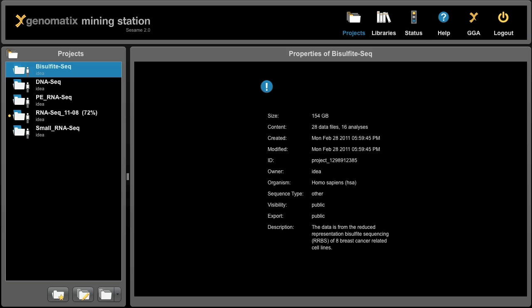The Genomatix Mining Station allows you to analyze all kinds of next-generation sequencing datasets. For now, I want to quickly show you how to map DNA methylation data. I've prepared a project with DNA methylation data provided by Illumina, which was generated using the RRBS protocol.